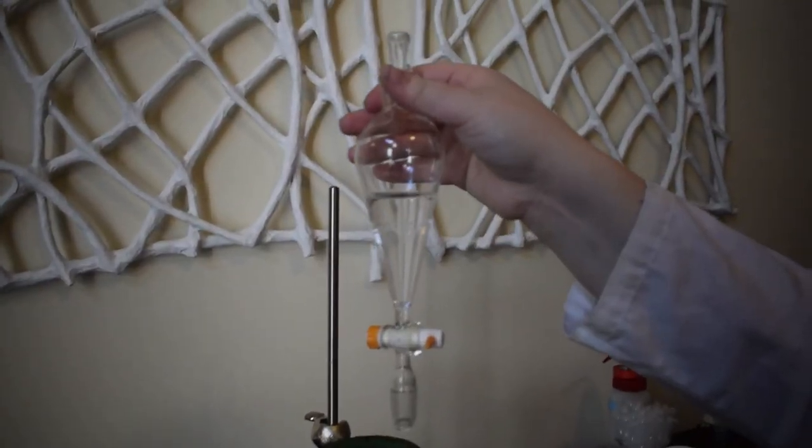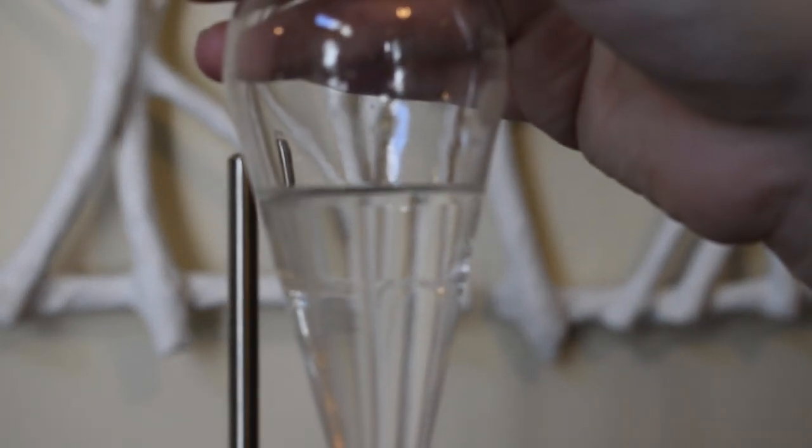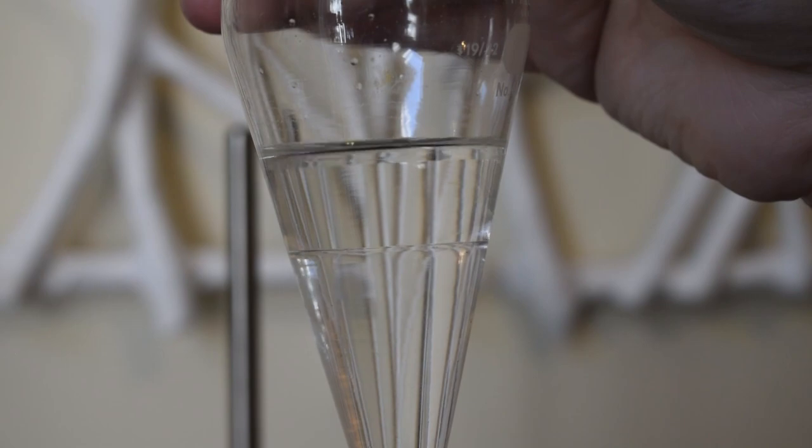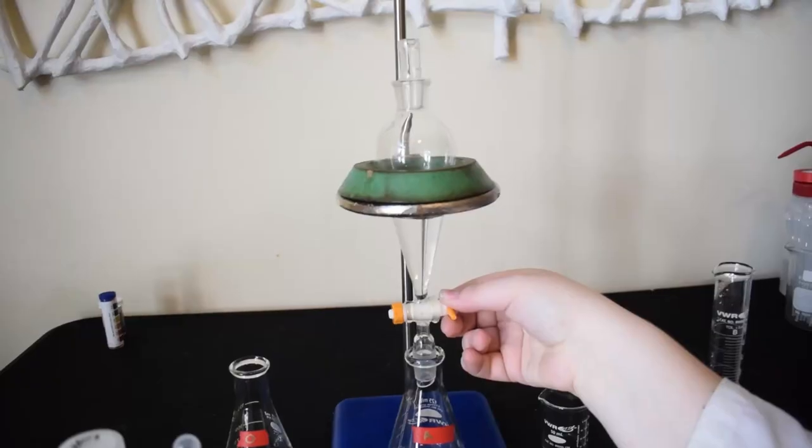Once that's done, we are putting it back in the ring stand. As you can see, there should be two distinct layers forming. The top layer is ethyl acetate, our organic layer, and the bottom layer is water, which is our aqueous layer.